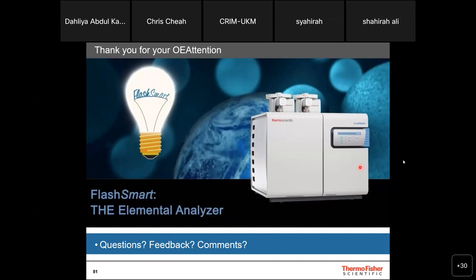Okay, that's great. And then another question from Dr. Shivkanya Fuloria: how can we utilize the CHN analyzer in the pharmaceutical industry, especially in drug analysis? Doctor, for drug analysis, if you want to determine what the organic compound or the drug-specific compound is in the pharmaceutical industry, you will need to use GCMS or LCMS. Elemental analyzer usage in pharmaceutical is more on getting the nitrogen content as well as the sulfur content. It's not so much about determining what ingredients or drugs are present in the pharmaceutical. Okay, sure.